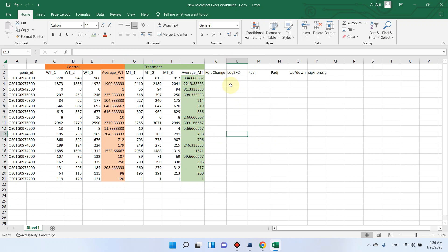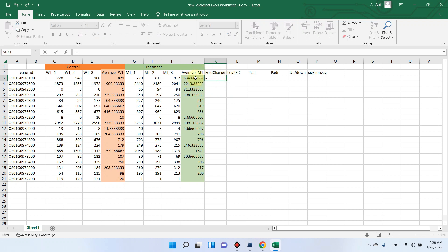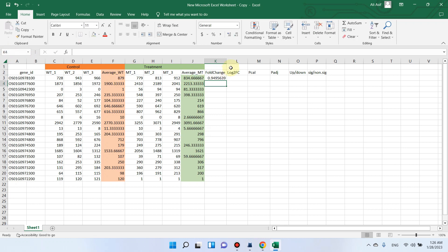Now our first task in RNA-seq data is to know how much fold this value is different from its control. For simplicity we can just do this by formula — we need to divide the mutant type value by the control value. So we divide this cell by the control cell, which will calculate the FC value.